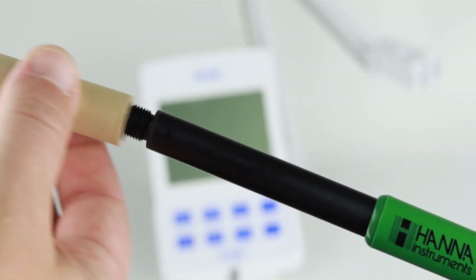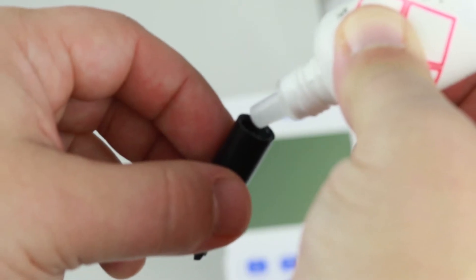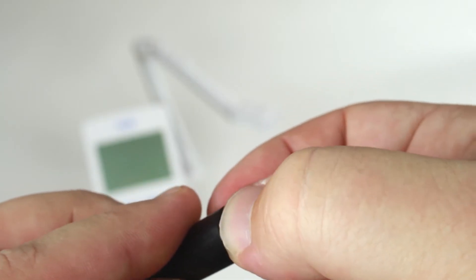To set up the dissolved oxygen probe, first remove the cardboard shipping tube. Take a dissolved oxygen membrane and O-ring and rinse the membrane with some dissolved oxygen electrolyte. Next, position an O-ring at the bottom of the threading for the membrane cap.